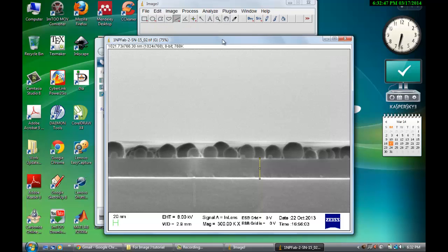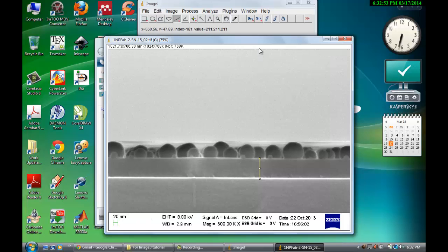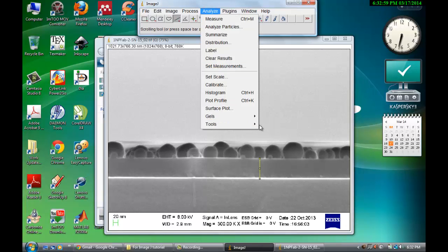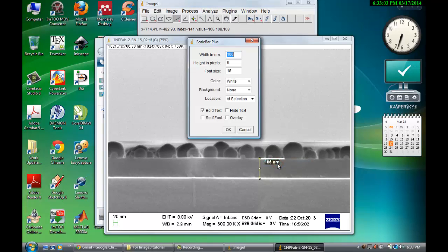And the other thing which I want to tell you is that this is the image we measured. Now you don't want to use this scale. You can make any scale bar anywhere. So for that you go to Analyze, Tools, and Scale Bar.